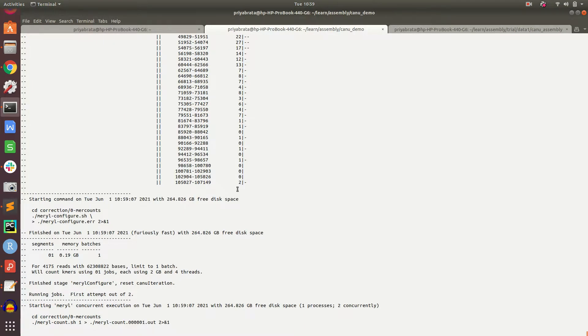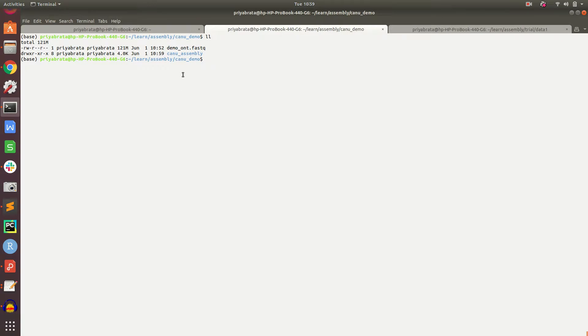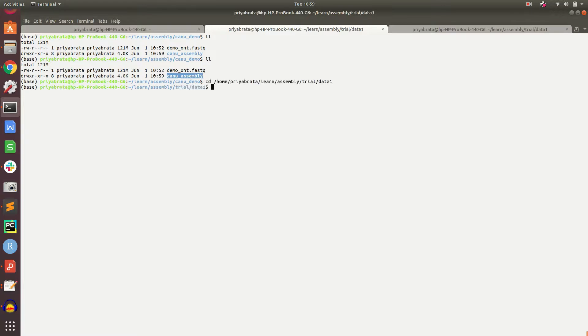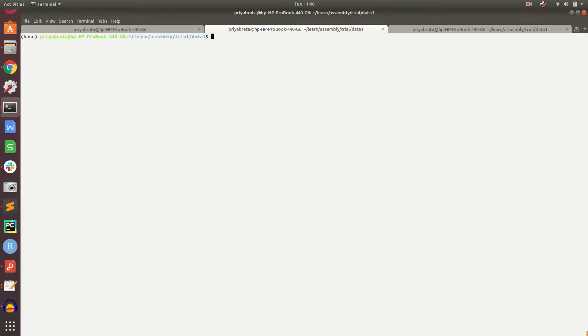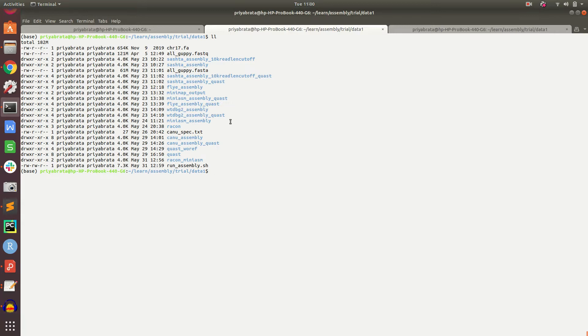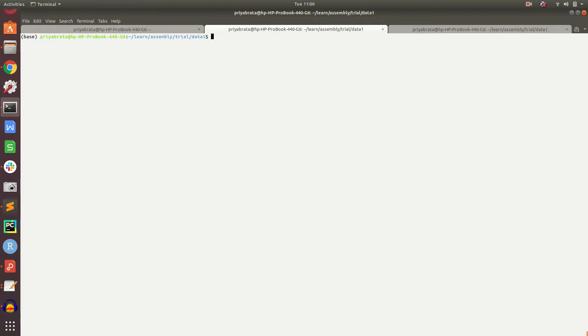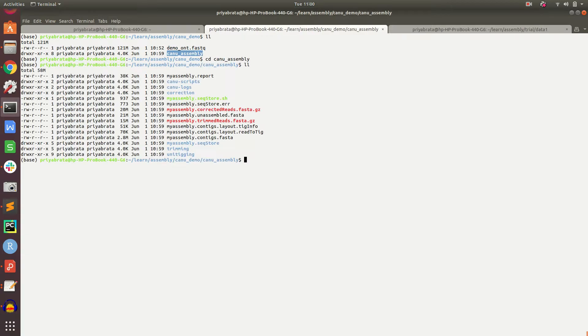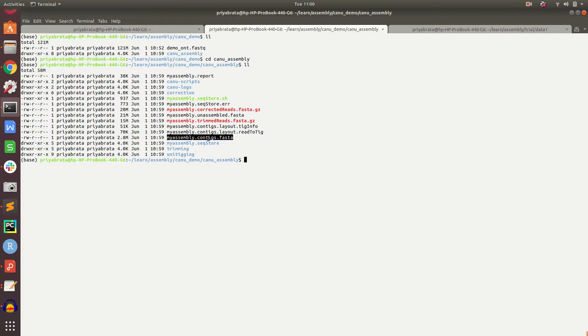The assembly process has finished. We can go inside the assembly folder and see there are many outputs. The important one is myassembly.contig.fasta, which we will use in the QUAST process.